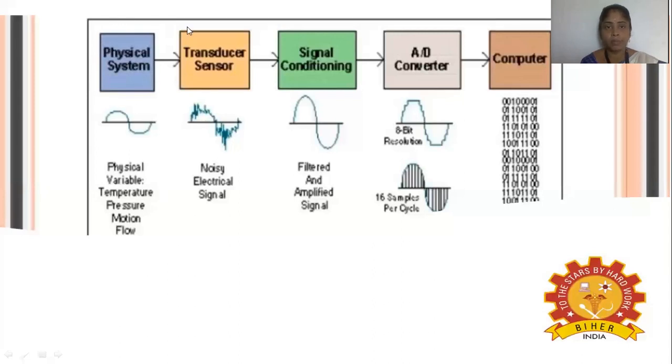Here is the data acquisition system workflow, how it is carried out. The physical system means that it is able to monitor temperature or pressure, or the flow rate, or the oxygen level, or, if needed, the foam or the water. Everything can be monitored as a physical system.